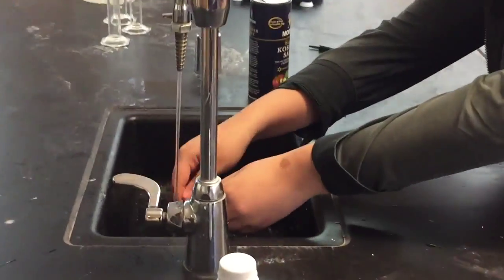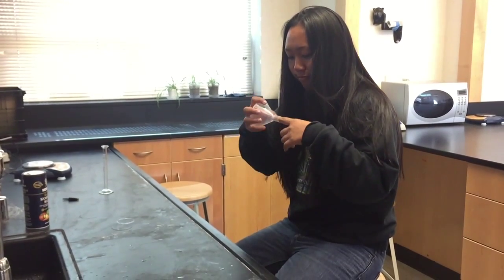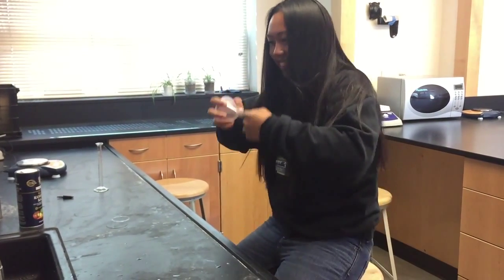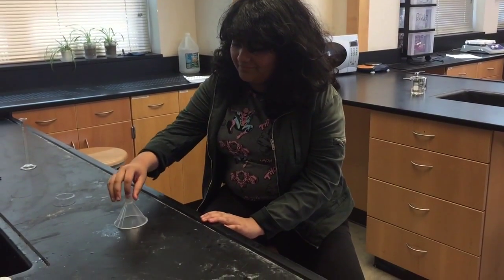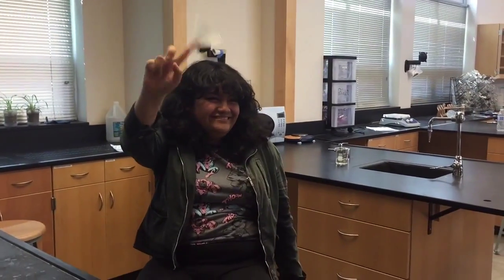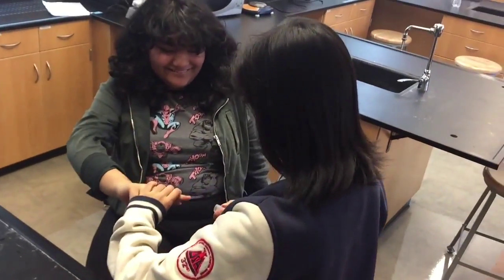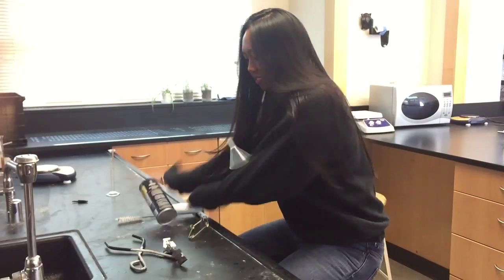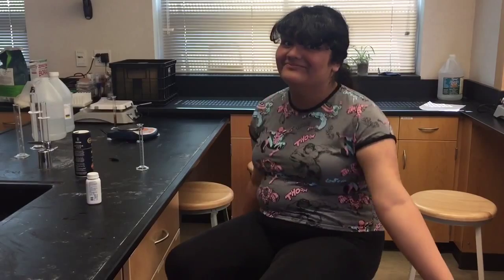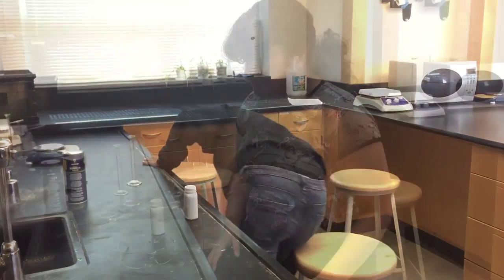Wash your hands after every experiment. Report all injuries or accidents to your teacher immediately. Tie back long hair and restrict any loose clothing. Wear safety goggles and gloves when instructed to do so.